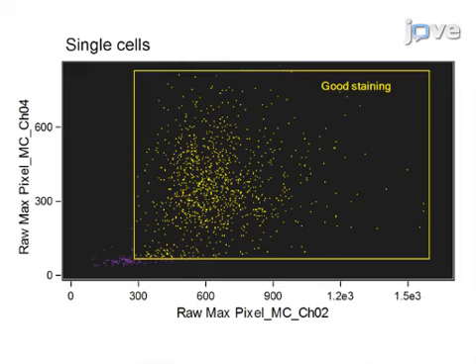The main advantage of this technique over existing methods, like microscopy, is that a large number of cells can be rapidly processed and automatically analyzed, securing statistically strong analysis of the morphological changes and the protein distribution in chemokine-stimulated T lymphocytes.